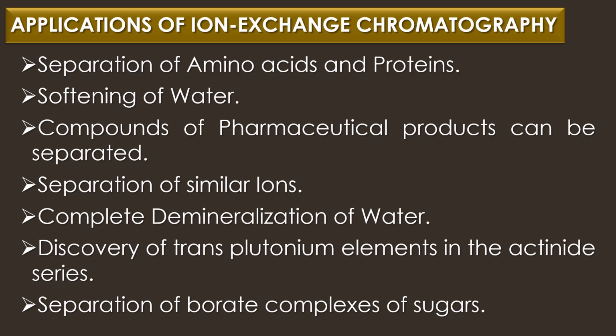Ion exchange chromatography is used in the discovery of transplutonium elements in the actinide series. And finally, ion exchange chromatography is used in the separation of borate complexes of sugars.